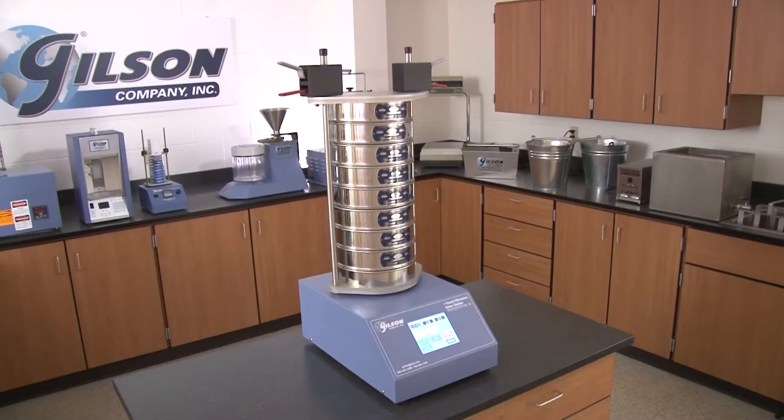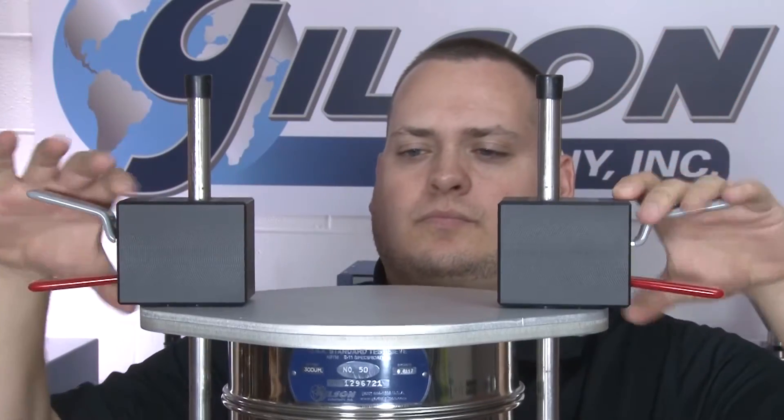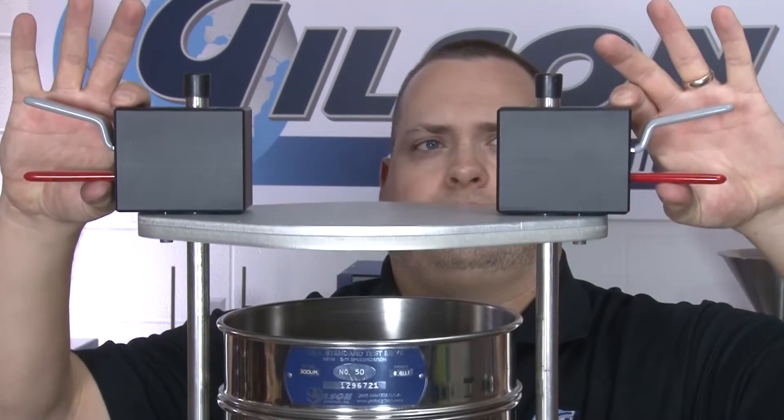This quiet and compact benchtop unit features a fast-acting clamp assembly that quickly and easily locks and unlocks sieves in place, assuring efficient transfer of vibration energy.